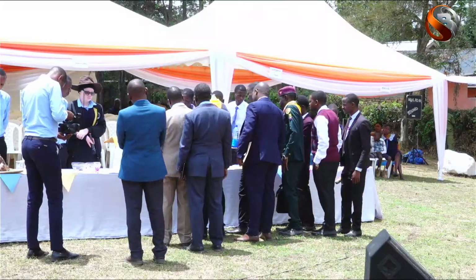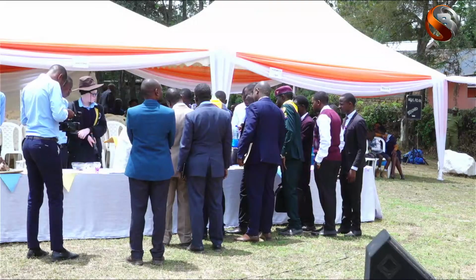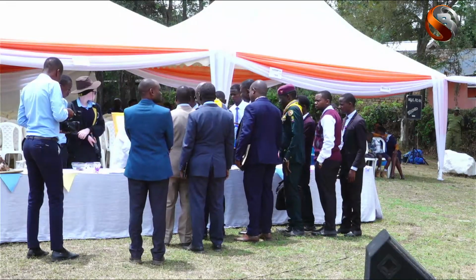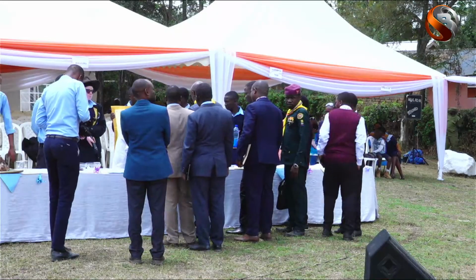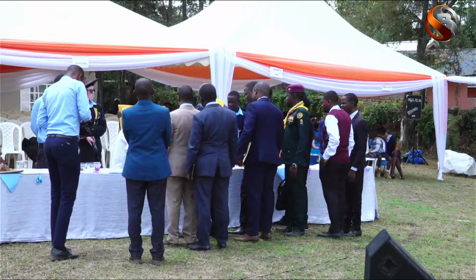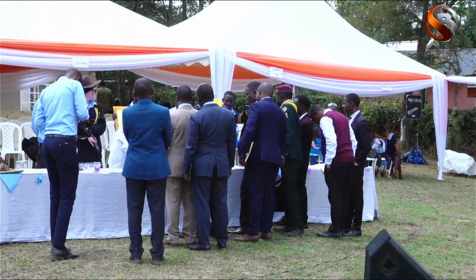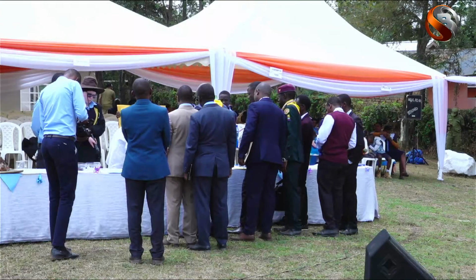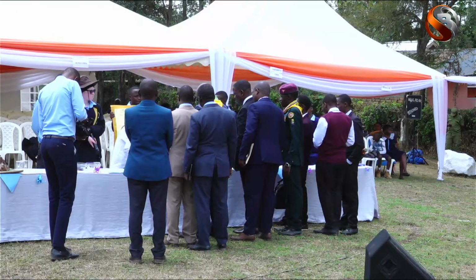Now, guest of honor, we need to tell you some parts, organs which are found within this organism, and we are going to relate them to the human digestive system. This is Mammalia, but also this is Mammalia. So when my friend continues dissecting, we will see some organs found in this organism, which is a rat, and we compare it with the human digestive system.